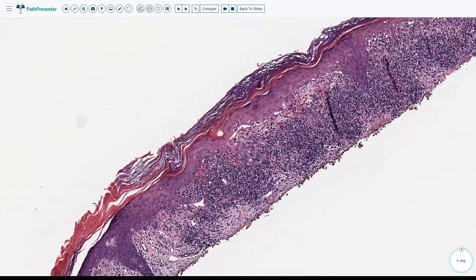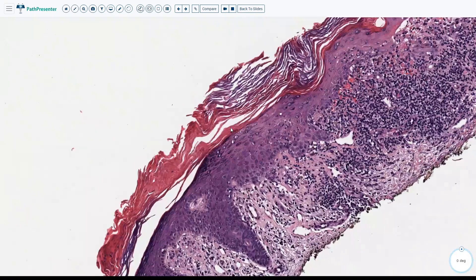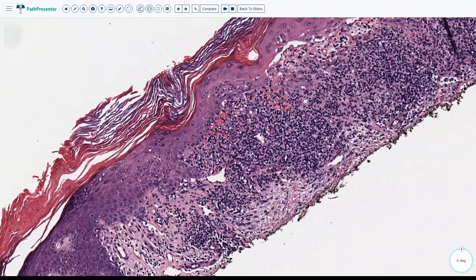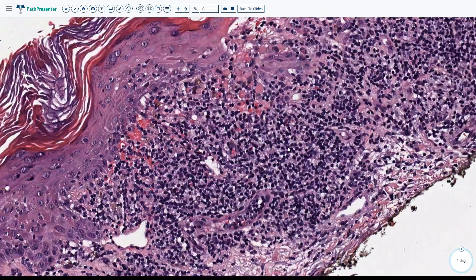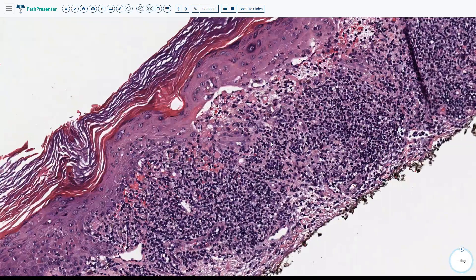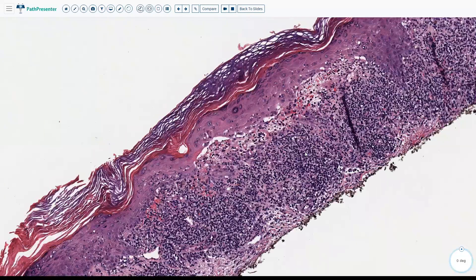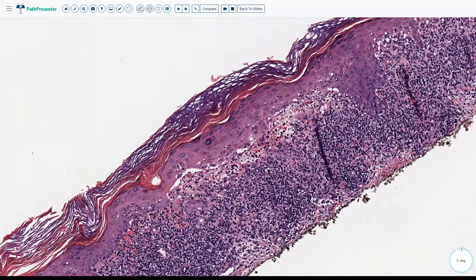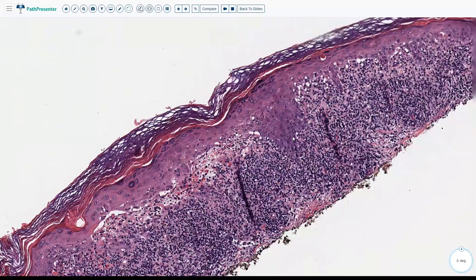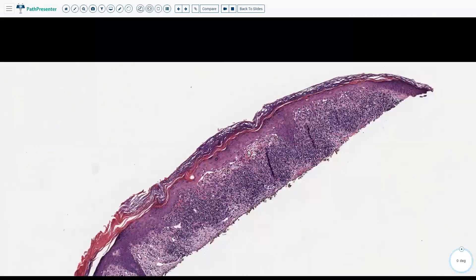Benign lichenoid keratosis tends to sometimes show some parakeratosis, which can help suggest this is not a rash of lichen planus but more likely a single lesion — though this is not always present, so you cannot base the diagnosis solely on the presence of parakeratosis. The other features are all the same: hypergranulosis, dense lichenoid infiltrate, dyskeratotic cells, and pigment incontinence. Clinical-pathological correlation is needed to differentiate between lichen planus and lichen planus-like keratosis.